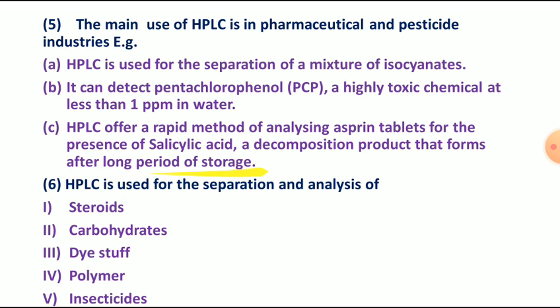Last, number 6. HPLC is used for the separation and analysis of steroids, carbohydrates, dyestuffs, polymers, insecticides. These we can easily separate with the help of HPLC. So these are all the applications of HPLC.